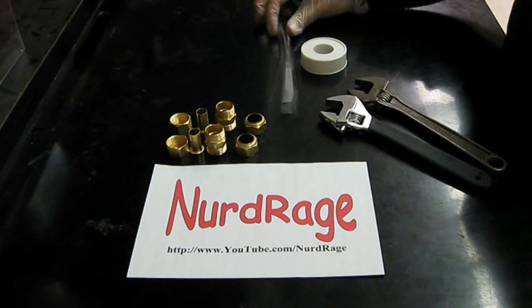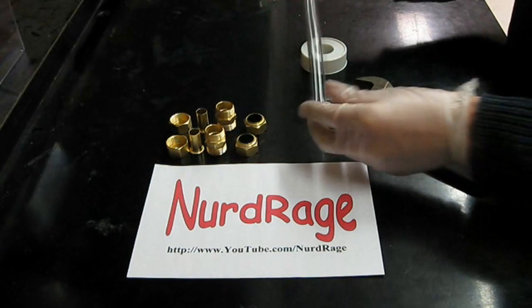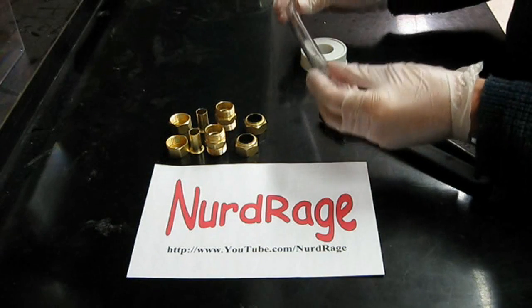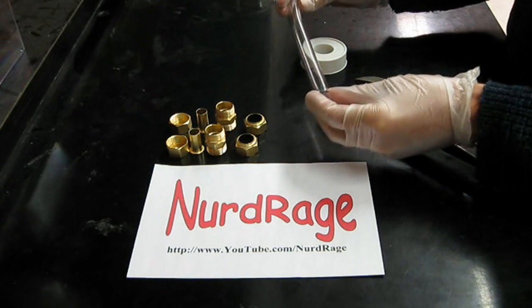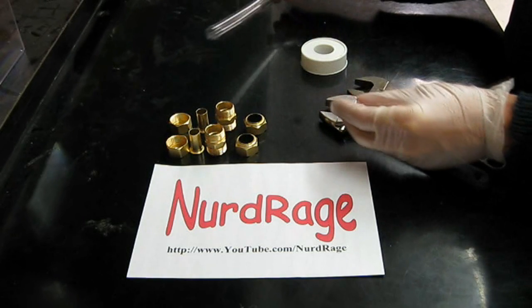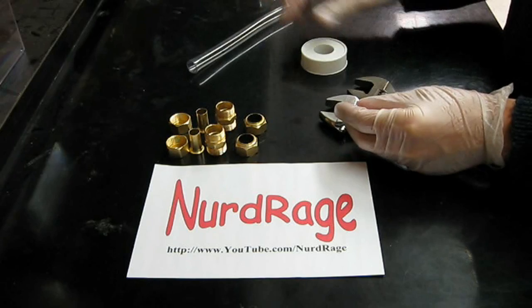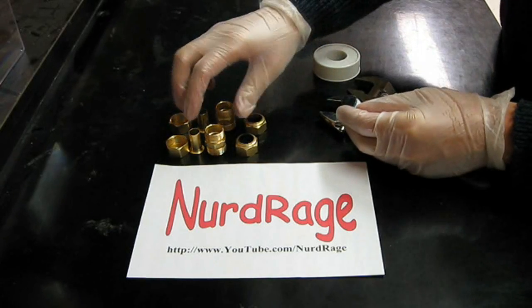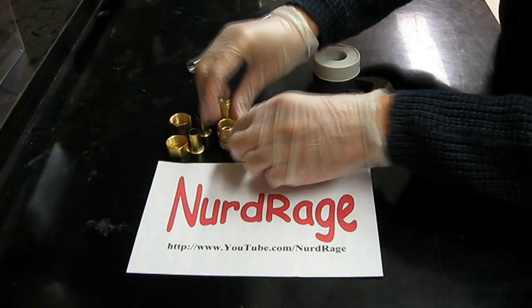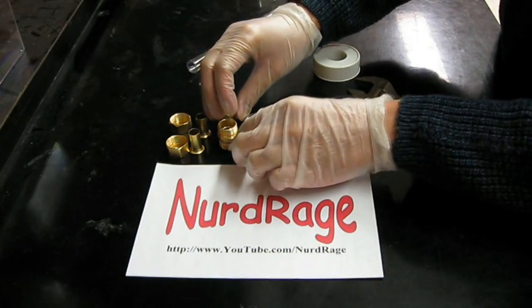Making the container is fairly easy. First you need a length of suitable tubing. I'm using vinyl for clarity, but vinyl is easily stained by the dyes. Polyethylene or polypropylene would give better results. Second, you need compression fittings and caps that fit your tubing.